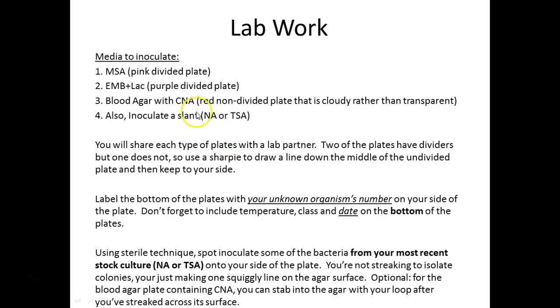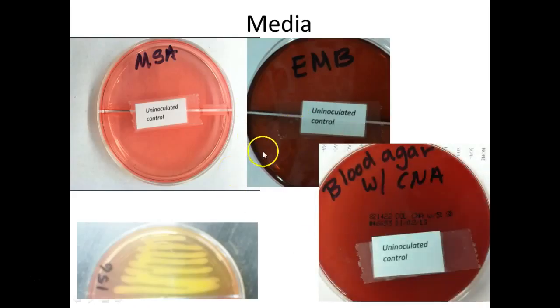And then we just did as a backup a new NA slant or TSA. So this is the media that we'll look at next time, and this is the media that your homework is about, reading about these 3 different types of media. And this is the last of the data that you're going to collect on your unknowns, although you have enough data today to actually figure out what you've got.